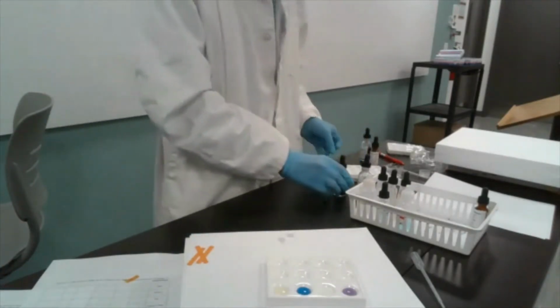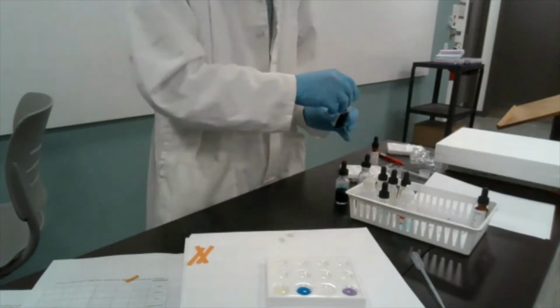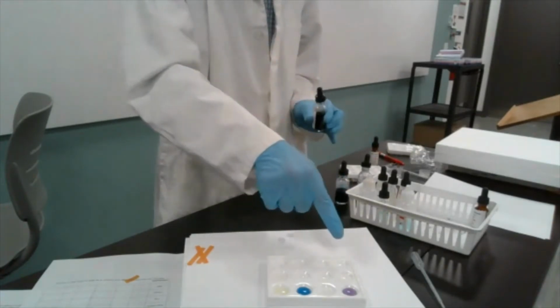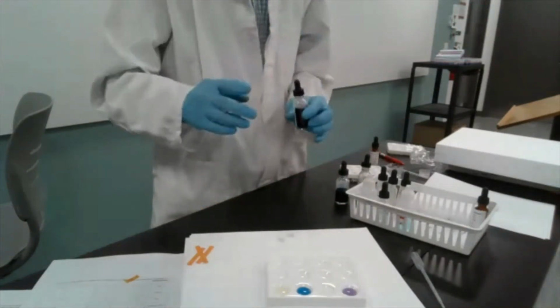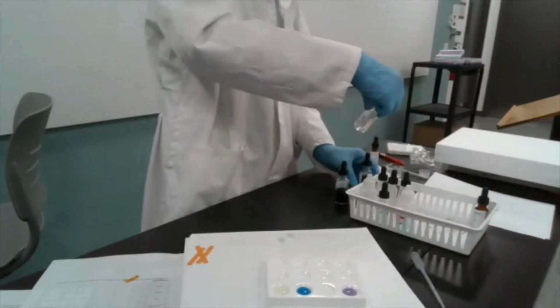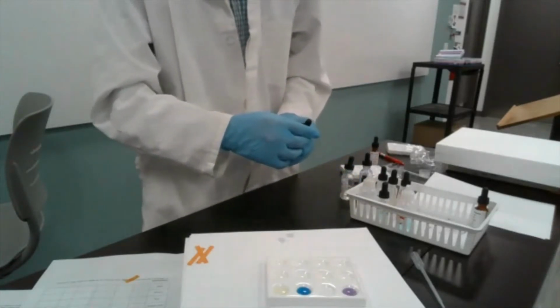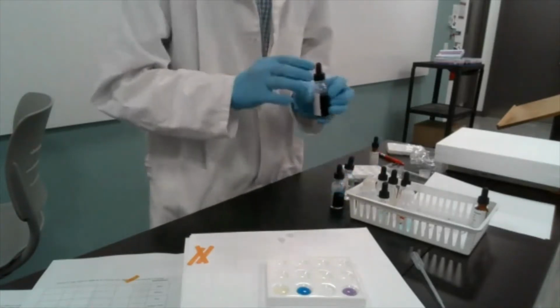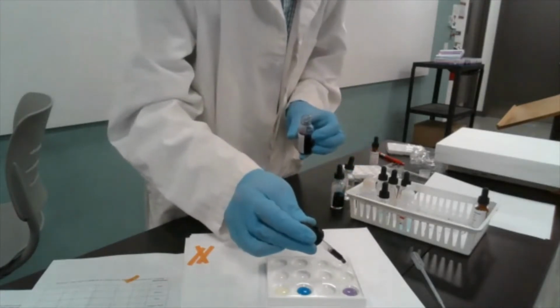I'll do sodium hydroxide next. And then I'm probably going to add everything without commenting, and then we're going to look at all indicators at the same time, just to make sure it doesn't take too long, because I don't know how much time Dan has planned for this.